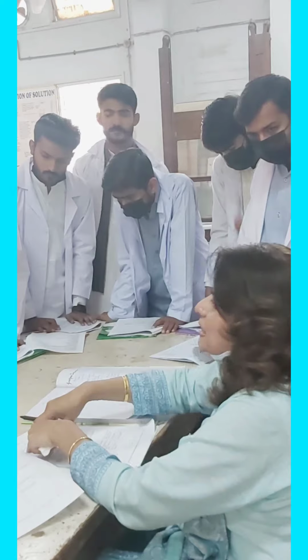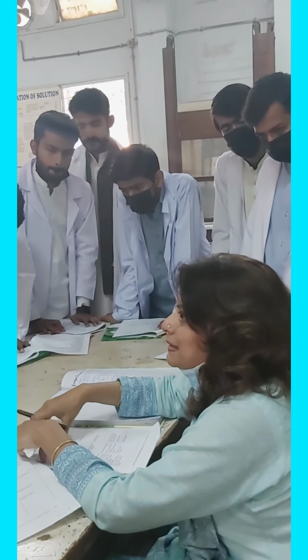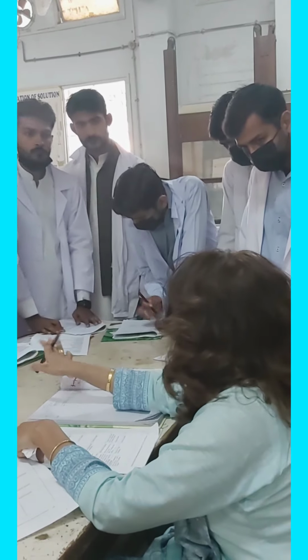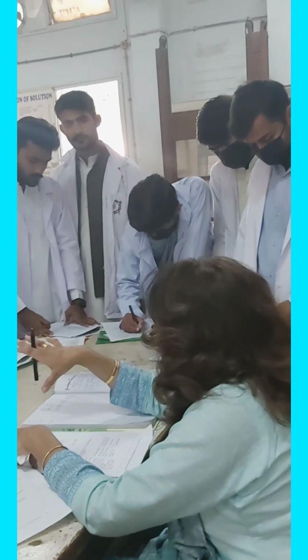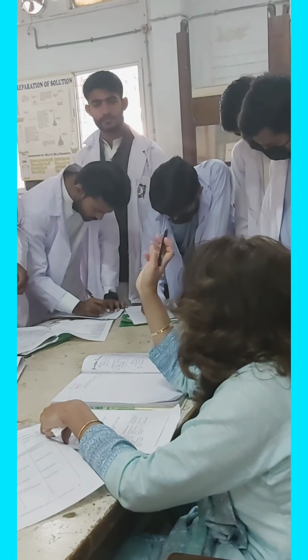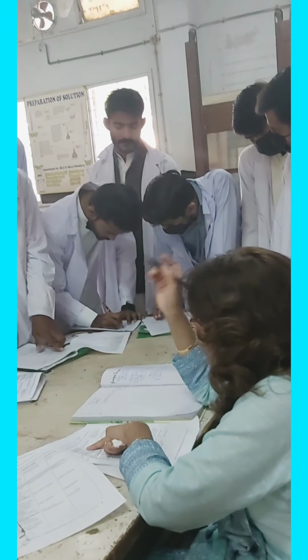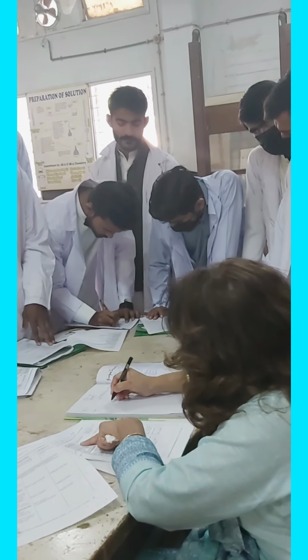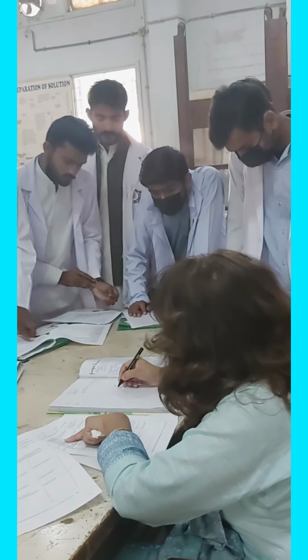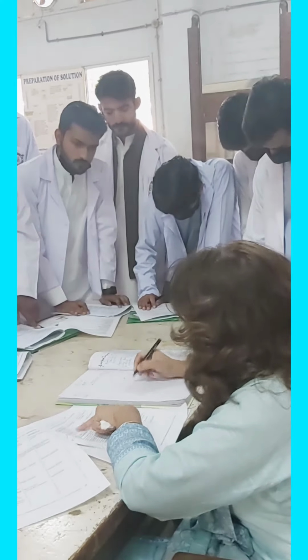In our case, if you treat that gas with lime water, you will come to know that it is carbon dioxide gas, nothing else. It is not ammonia, nitrogen or oxygen gas. It is carbon dioxide. So this is what they are saying: take a small amount of the given substance, your organic compound, in a test tube, add 5 to 6 drops of sodium bicarbonate, NaHCO3, and you will get effervescence.